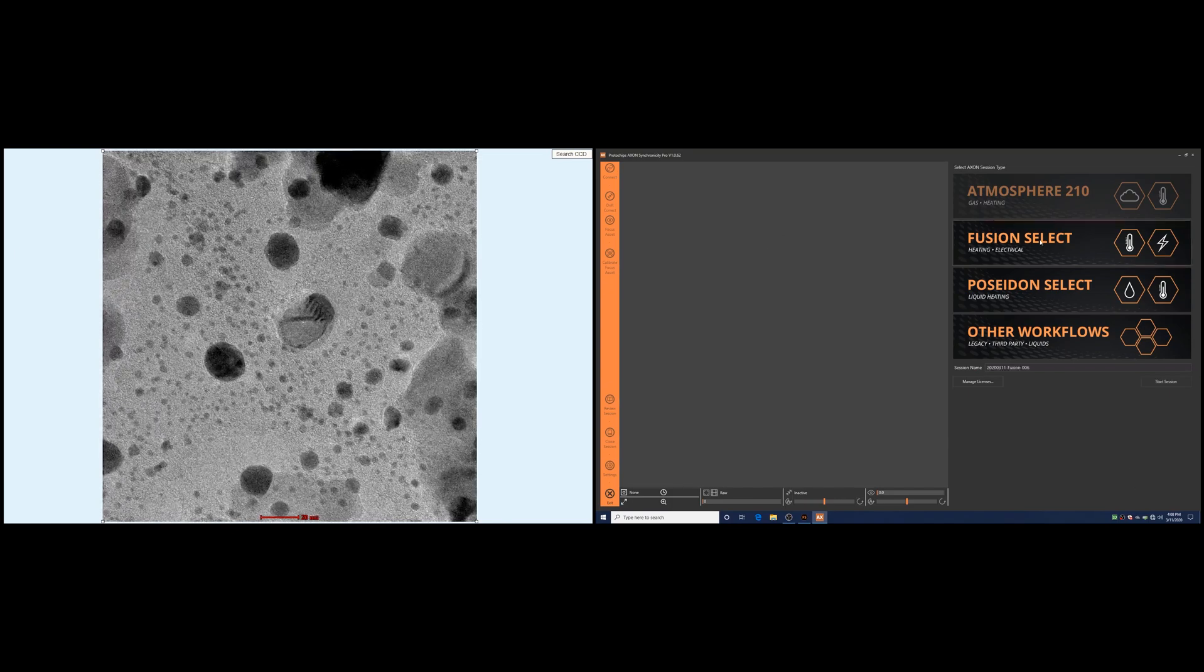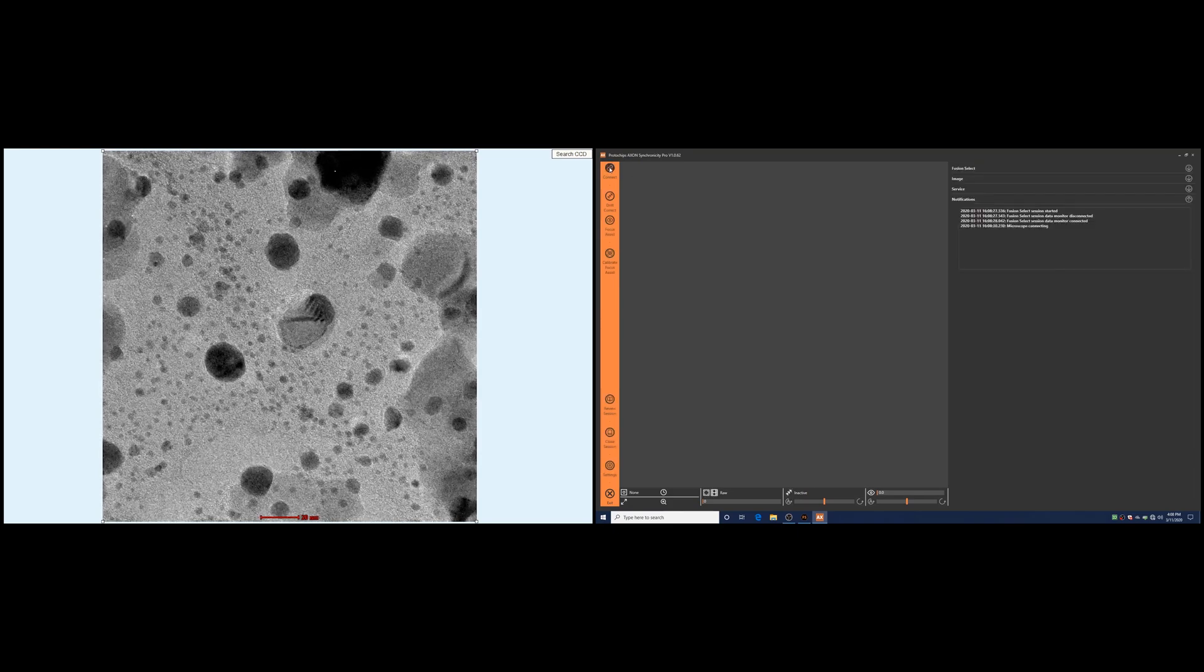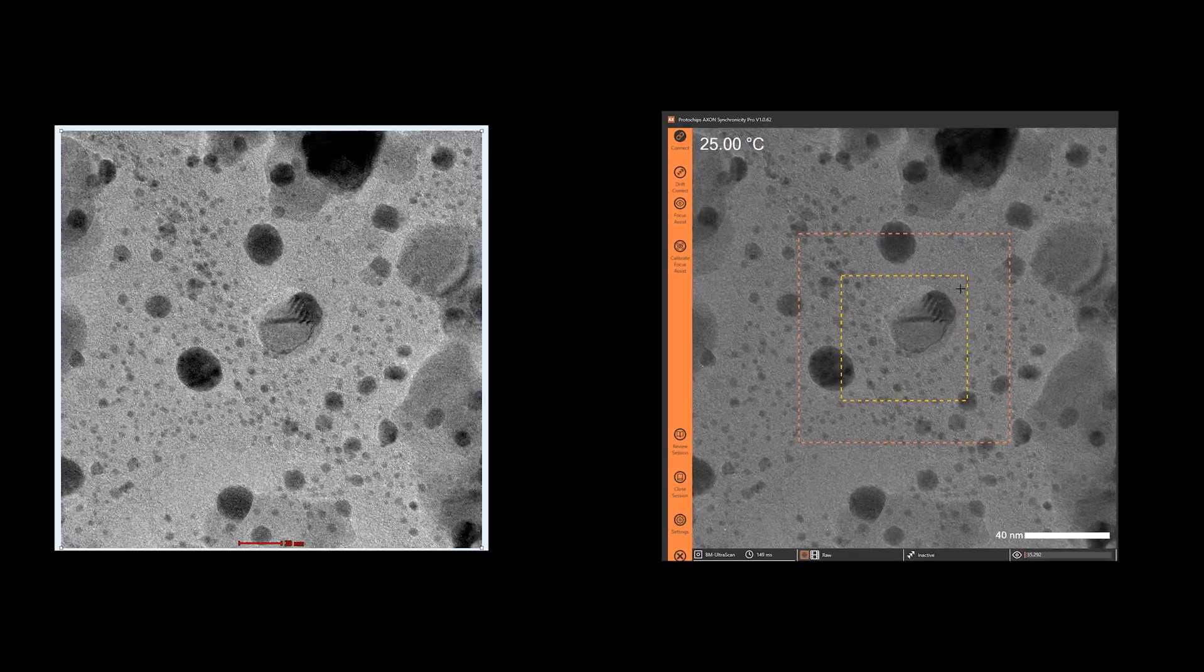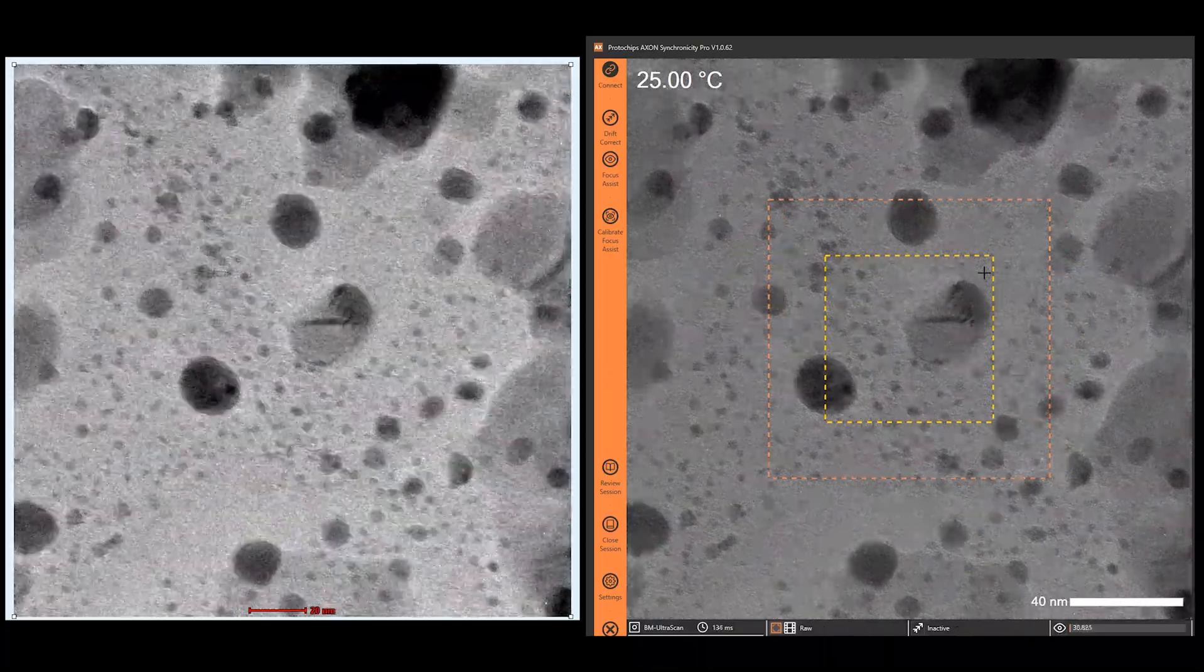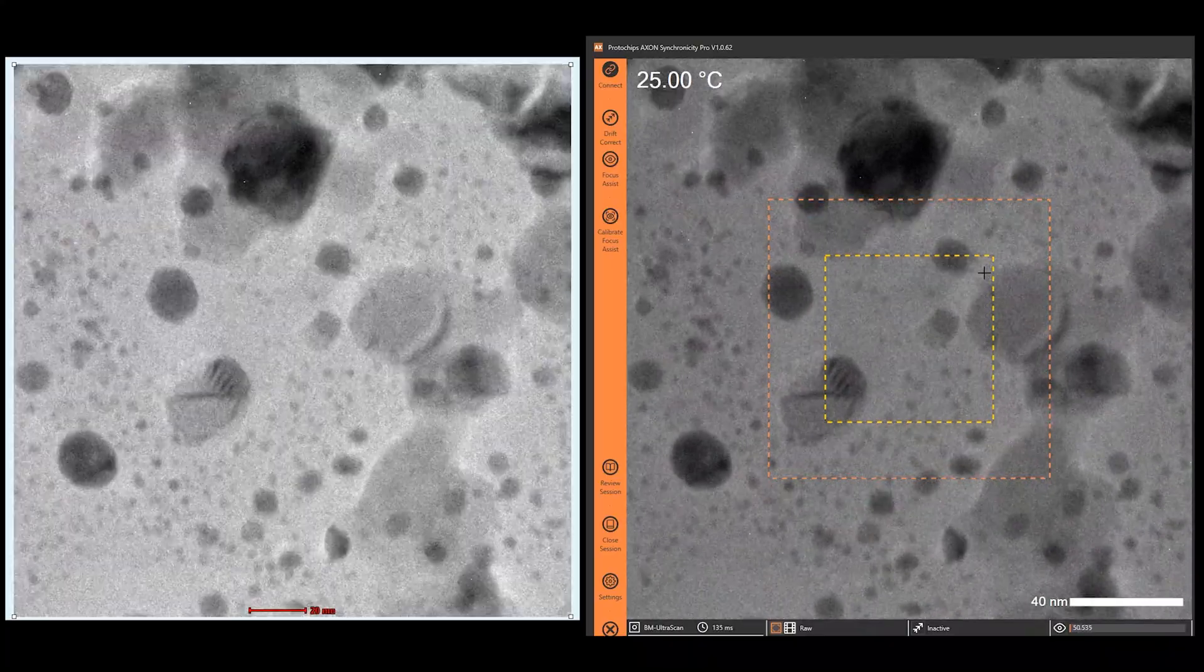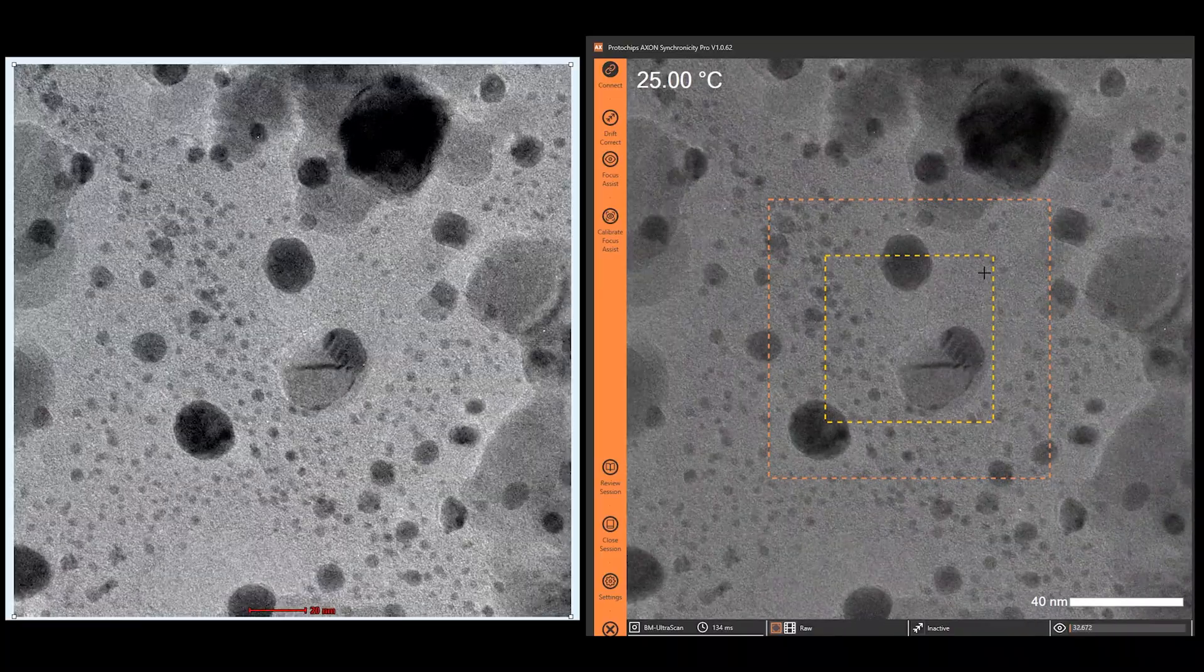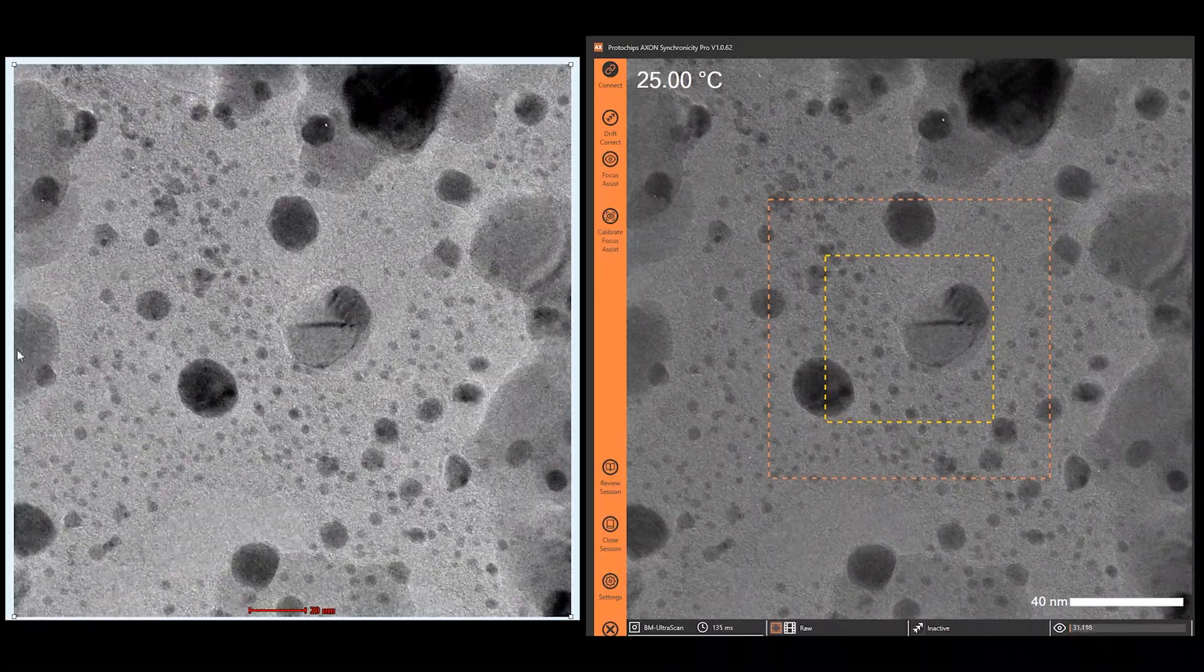In this demonstration, we are using a Protochips Fusion Select heating system to perform an in situ experiment. Let's zoom in on the image display from both monitors. Axon sees the same image feed as the main imaging monitor, and in this idle state, it suffers from the same image drift and defocus that can result from mode changes, stage movements, sample beam interactions, or the application of in situ stimuli.